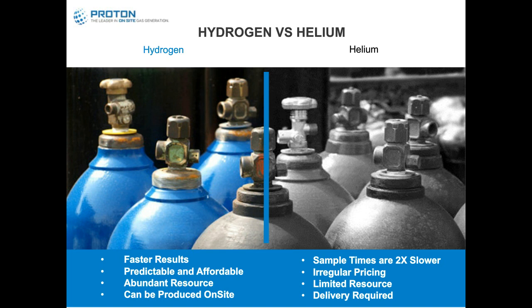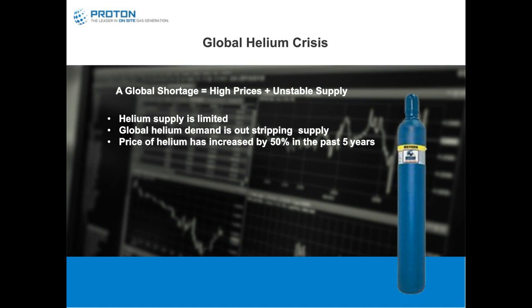The global helium shortage has caused a supply crisis worldwide that has resulted in high prices and an unstable supply. Even though the crisis has leveled off over the past year or so, it is certainly not over. Remember, helium is a limited resource. The problem cannot simply go away.